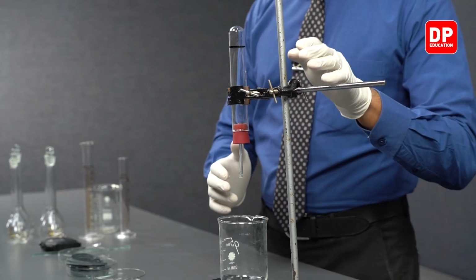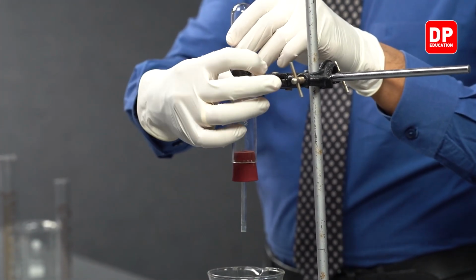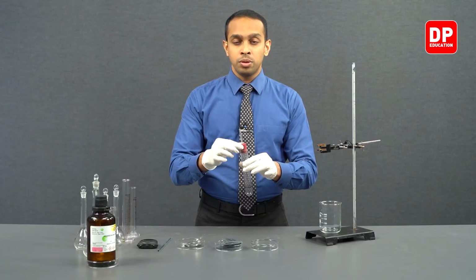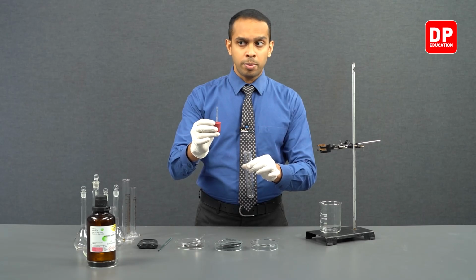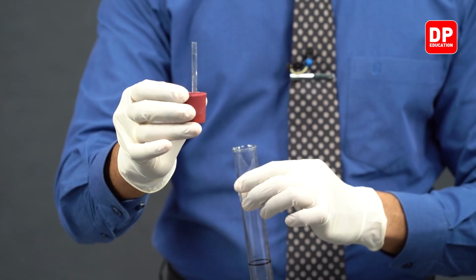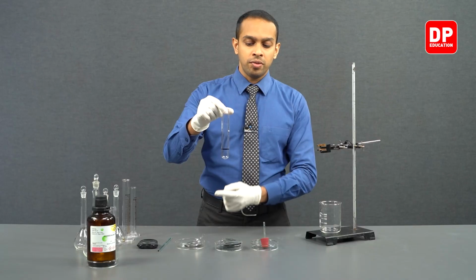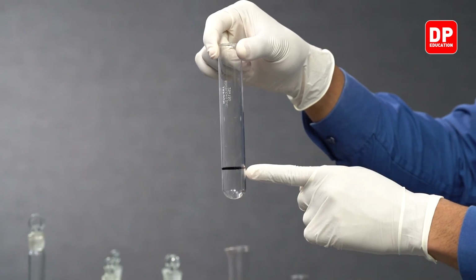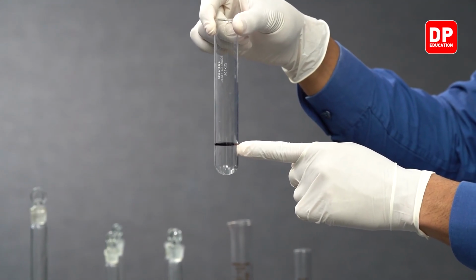Apart from that, we will be using the setup that we have over here. We have a retort stand and we have clamped a boiling tube connected to a rubber stopper, and on top of the rubber stopper you can see a glass tube as well. And if you observe this boiling tube, from the bottom of the boiling tube 3 centimeters above, we have drawn a line, a black color line.